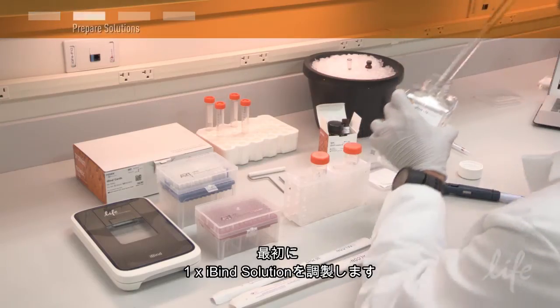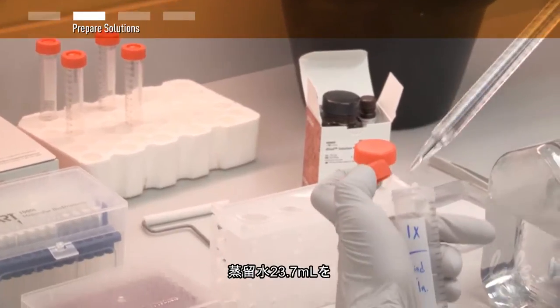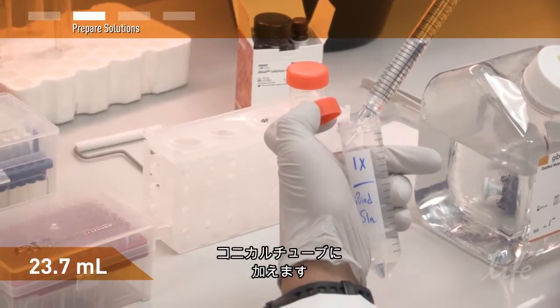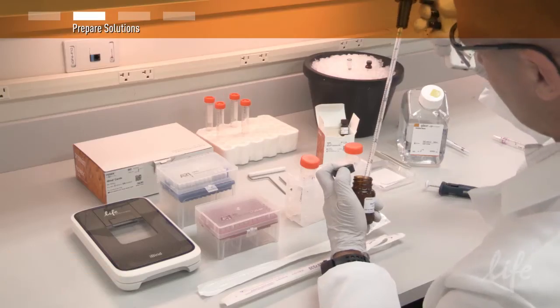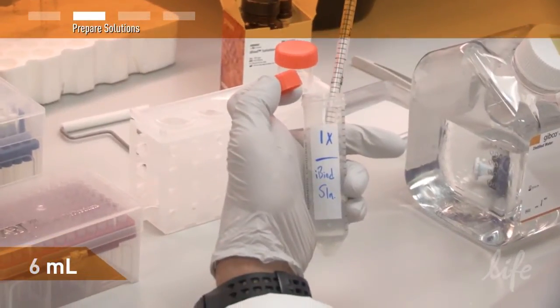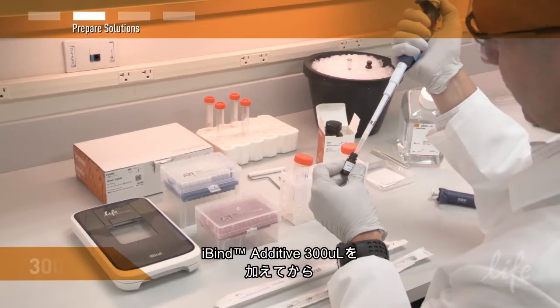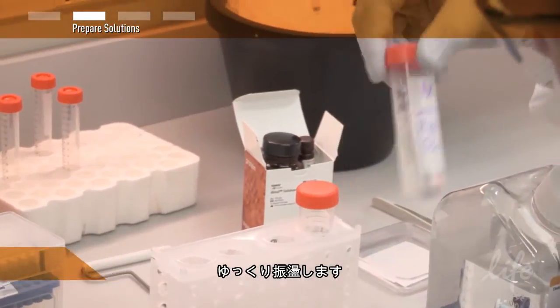The first step is to prepare the 1X iBind solution. Add 23.7 milliliters of deionized water into a conical tube, then add 6 milliliters of the iBind buffer, followed by 300 microliters of the iBind additive. Then swirl to mix.